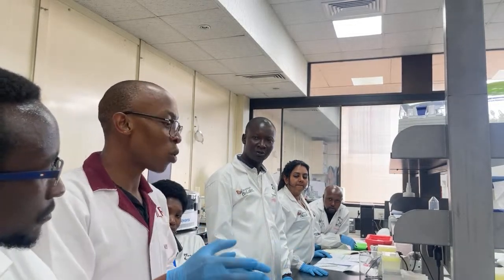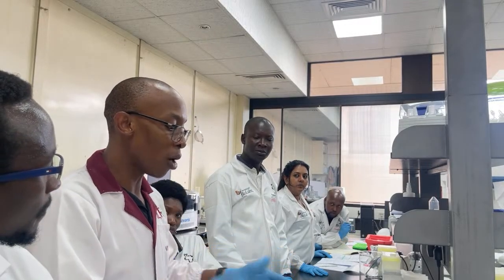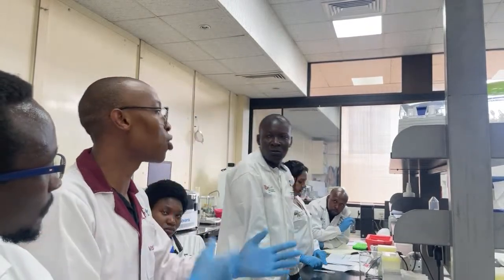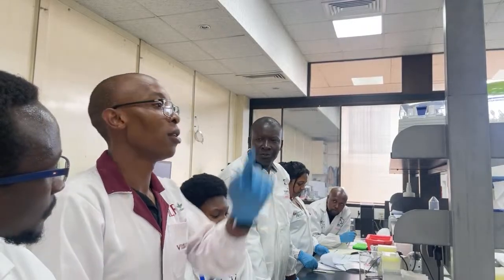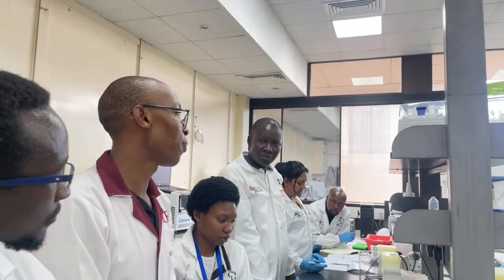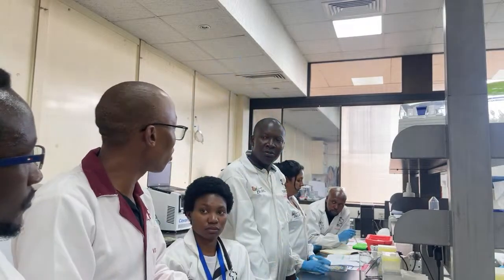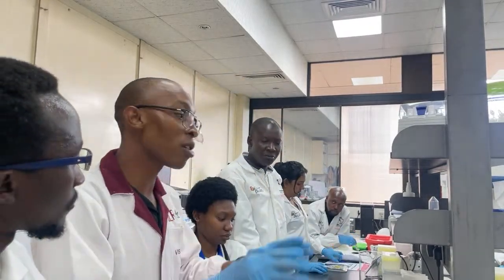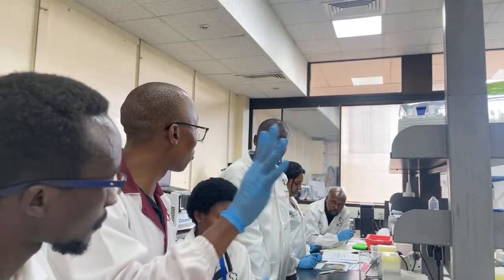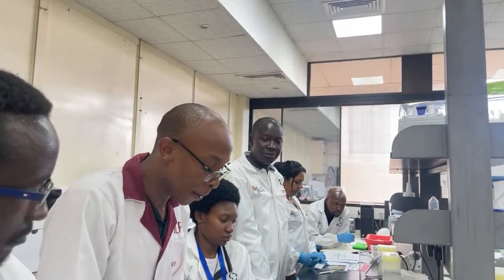That's what I said in the morning: in this technology, you don't have to wait to accumulate a certain number of samples to make it financially viable if you want to run a big genome. You run one, somebody sends you the next one, you load it, and the price is still the same. With some technologies, you need to load, say, 200 genomes on the same run. When are you going to get 200 genomes? If you run that one genome on that, you lose out. It's way expensive.